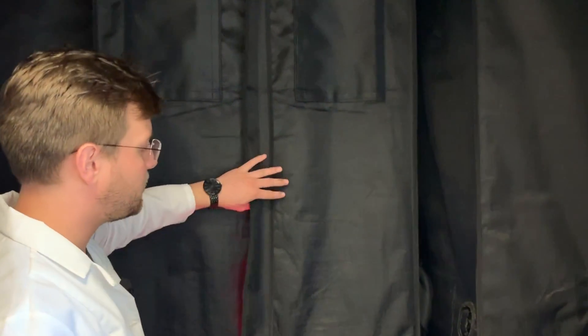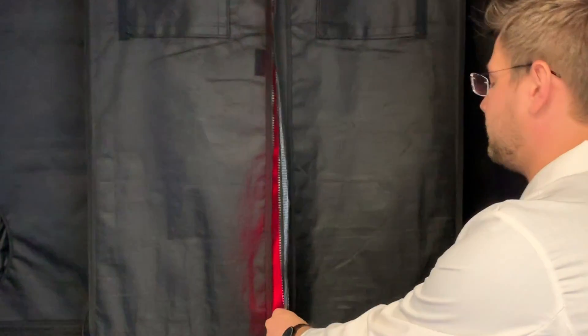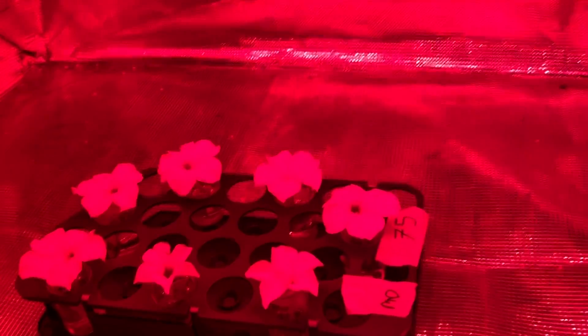This is a second spectral science room. In this room we have smaller light chambers and each light chamber is a different amount of red light. In this particular example, I have petunia flowers being treated under red light. The LED panel is underneath and the flower samples are down here being treated for 12 hours of red light.